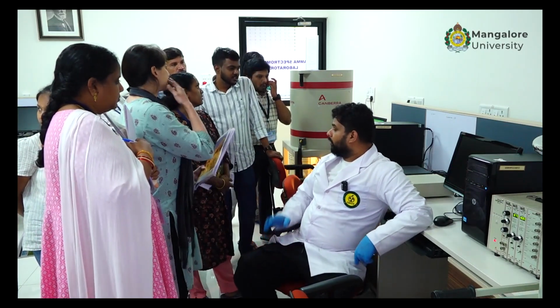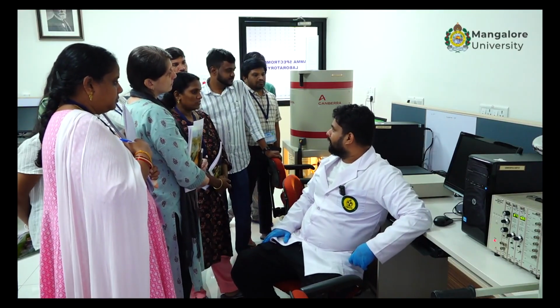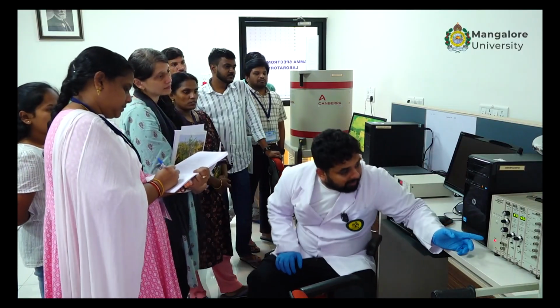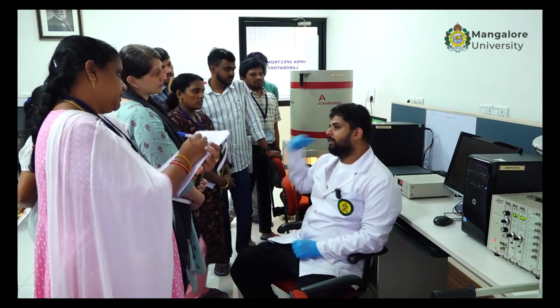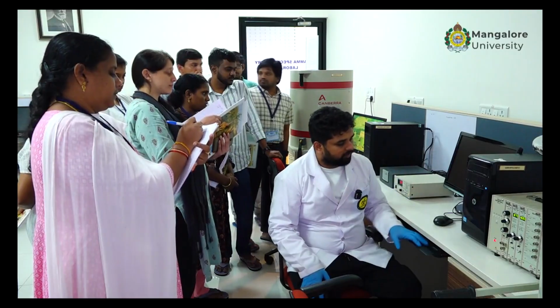It is only with this analog. The digital systems are very much seamless. MCA, how much? This one is 16K. And the other one? This is 32K. All others are 16, this is 32. So we'll just wait for the system to turn on.